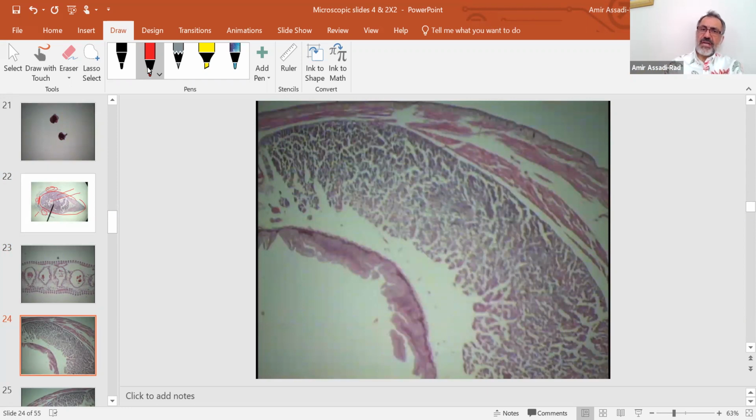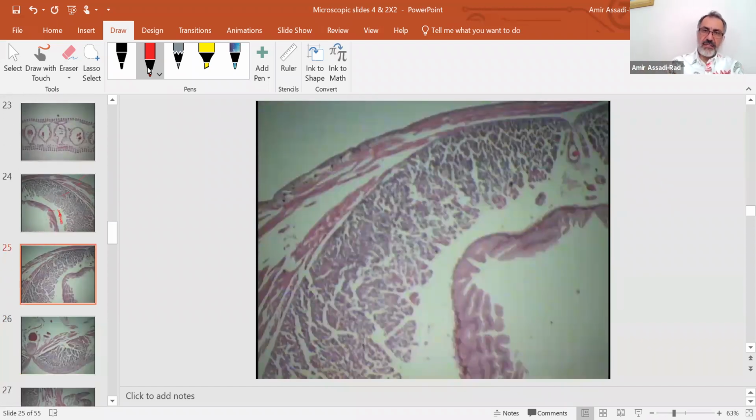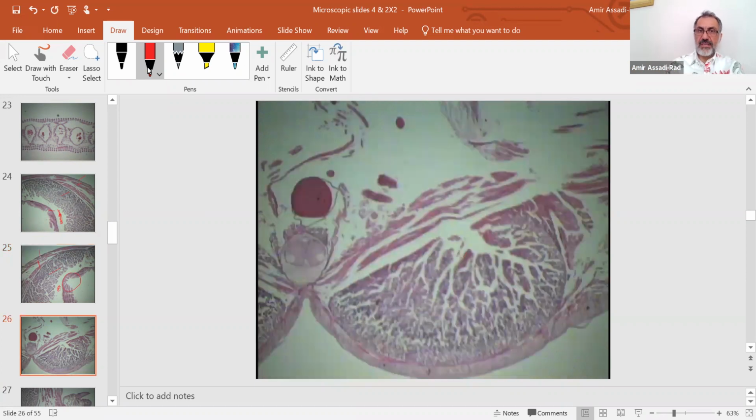This is your Nereis virens, epidermis, circular muscle, longitudinal muscle, and gut. And then, of course, this area that I'm drawing lines around, that would be your coelom. These are coelomate animals. Same thing again, the gut, coelom, circular muscle, longitudinal muscles, circular muscles, all of this, and this is epidermis. That's all you can see in here.